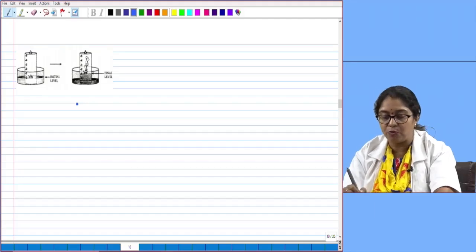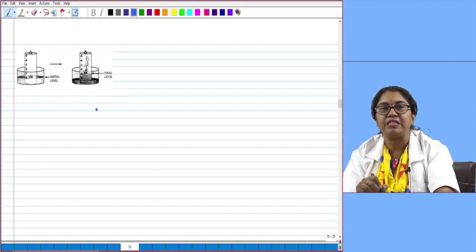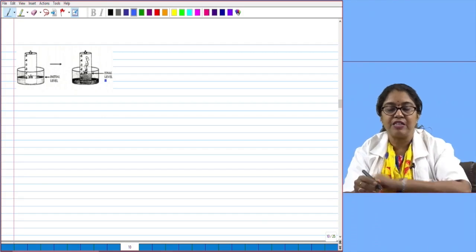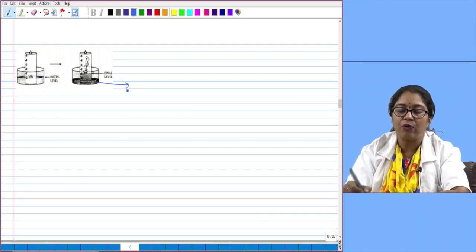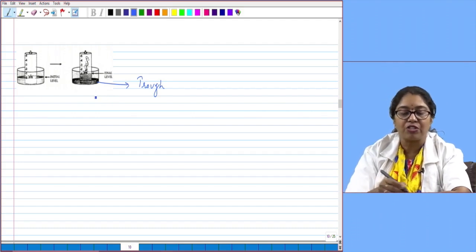This we will have a small experimental setup. Okay, so this is the experimental setup we have. What we do, children, we take two troughs. These are the two troughs, children. In these troughs, we take water, fill this with water, and then we take a small watch glass, children.